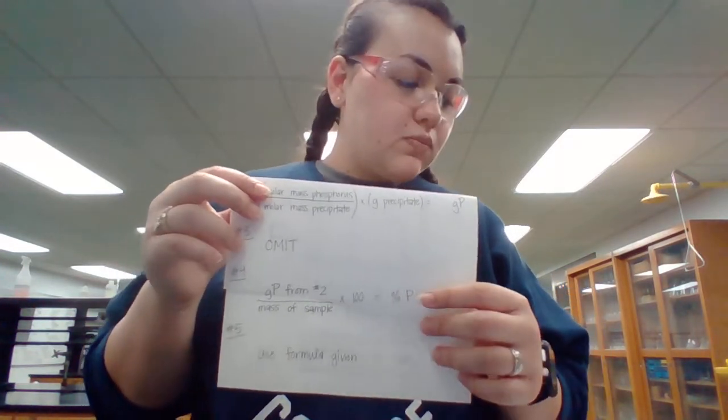You're going to divide those two numbers and then multiply that answer by 100, and that will give you percent phosphorus. And then for number 5, you're going to use the given formula. It tells you, assuming the manufacturer has correctly reported the percentage of P2O5, calculate the percent error of your analysis of phosphorus. So the biggest mistake I see with this is that people either aren't sure what the number 1 and number 2 mean, or they forget the absolute value bar, and you end up with a negative number and a negative percent, which of course isn't correct.